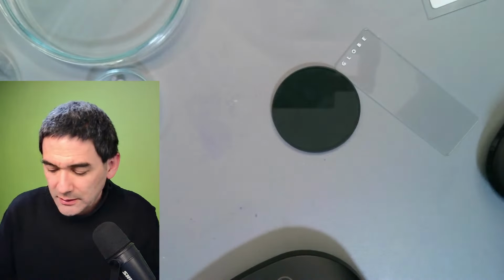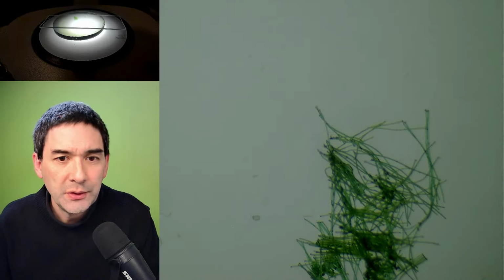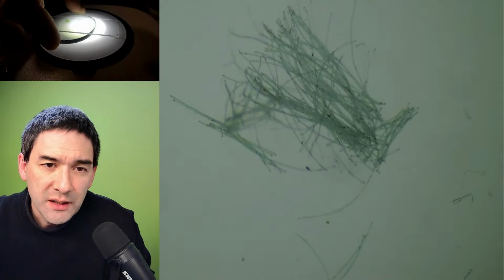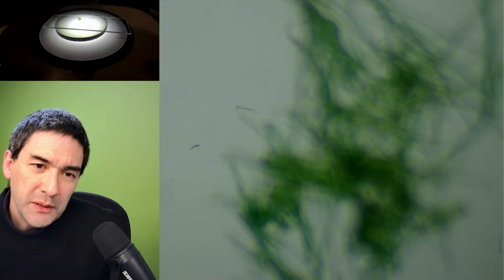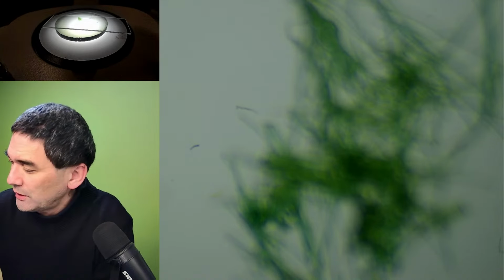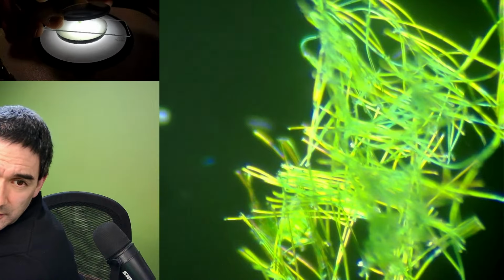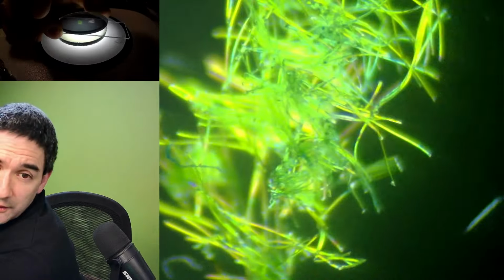Later on, I'd like to make a proper mount, and then we're going to see how this looks at high magnification. Again, under the stereo microscope, let's have a look closer. It would be interesting to see if this also looks kind of nice. This is now the colored one.